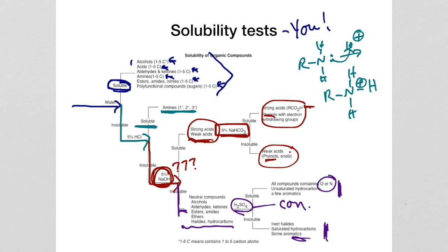These solubility tests should not take you very long, and your procedure outlines for you what indicates a positive solubility test. You should be able to knock out your solubility test for both your solid and your liquid on the first day of lab.